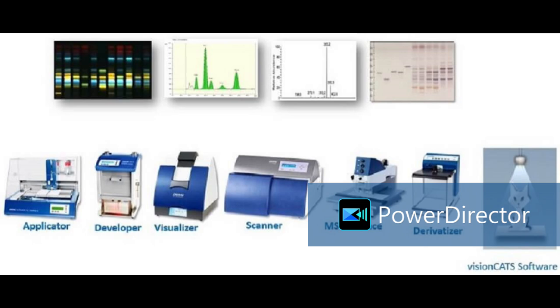Suppose these three are from one sample. This one is from the second sample, this the third sample, 4, 5, 6. So the chemical fingerprint of each is different. The HPTLC fingerprint is different, and the components also have intensity differences. The intensity is higher in this one, lower in this one, and this one does not have that compound at all. At the same RF value there is the same color. So each ink has its own kind of HPTLC fingerprint, and based on that we can differentiate between two inks.